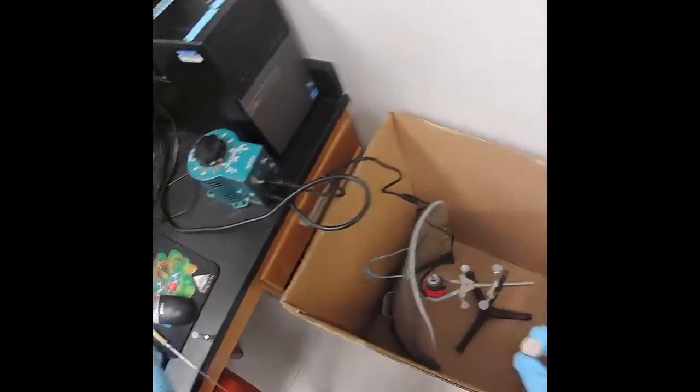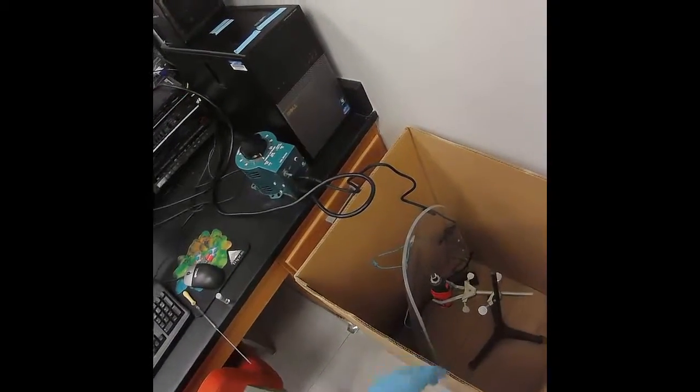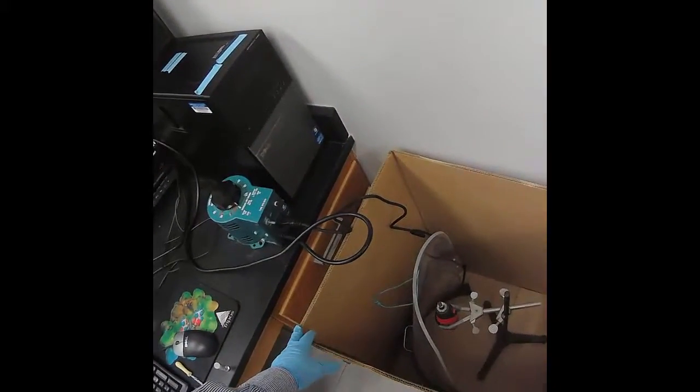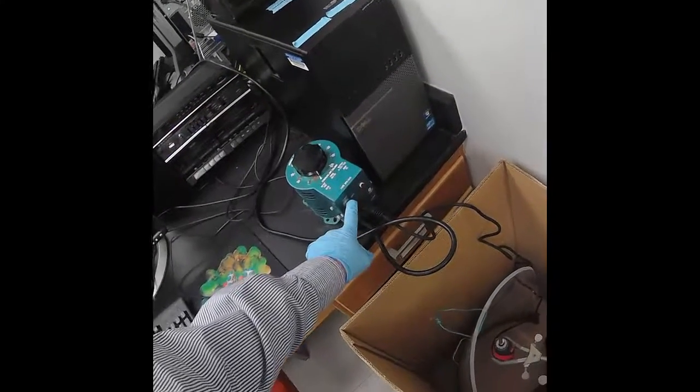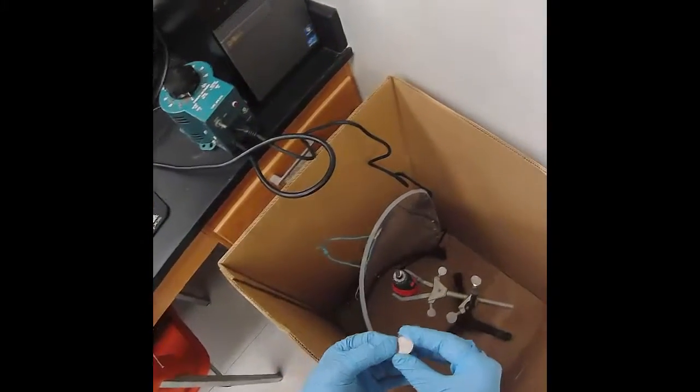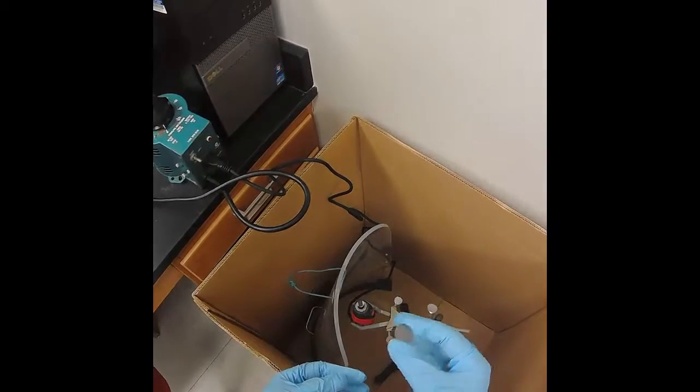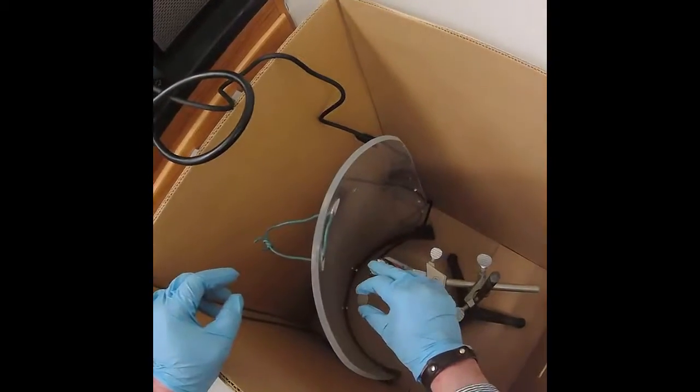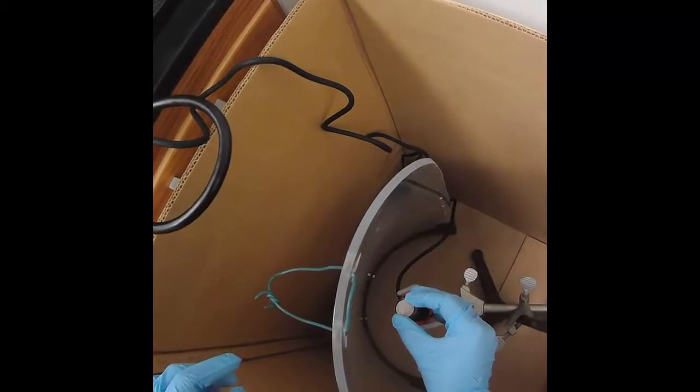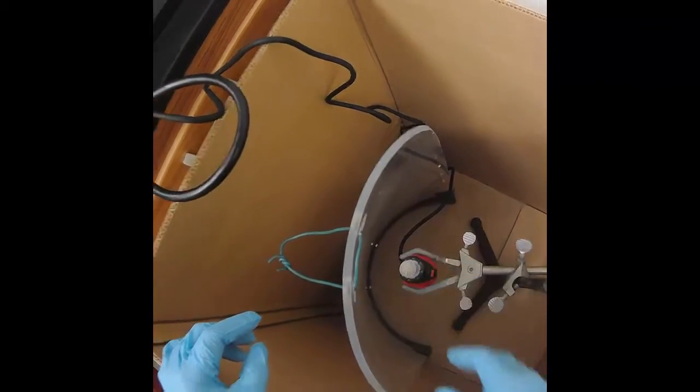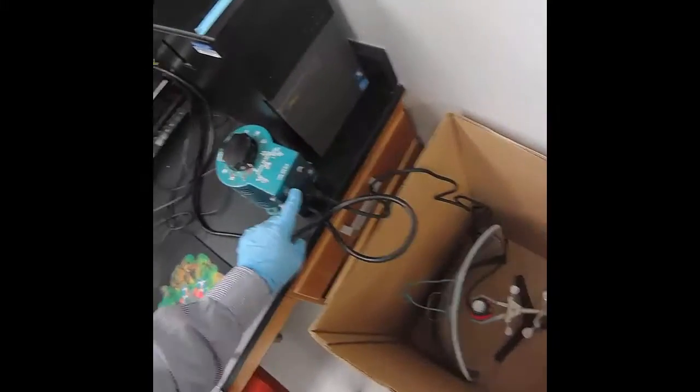Our homemade spin caster consists of a Dremel tool mounted in this box. The speed is going to be controlled by the variac. So first we're going to center our sample holder, the steel, onto this magnet so that it will spin evenly when we turn on the Dremel tool.